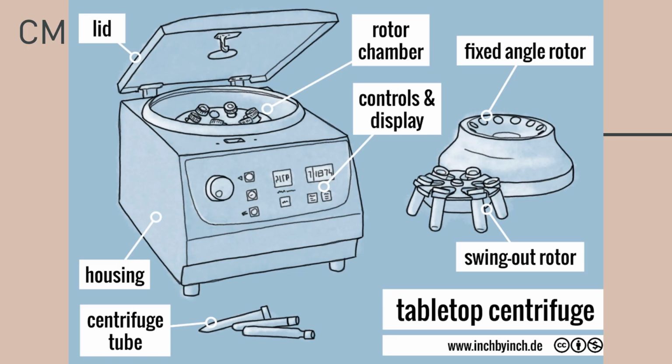Moving on, this is an illustration of a clinical centrifuge. You have the different parts here. You have the lid, the rotor, the display, the controls, the housing, of course your centrifuge tube, and others. These are the parts of your clinical centrifuge.